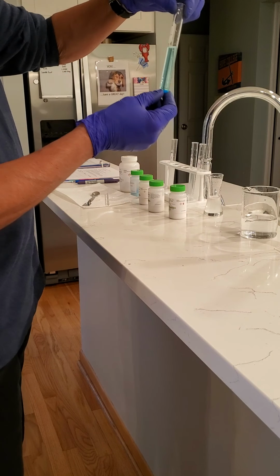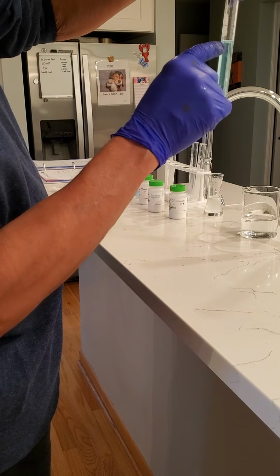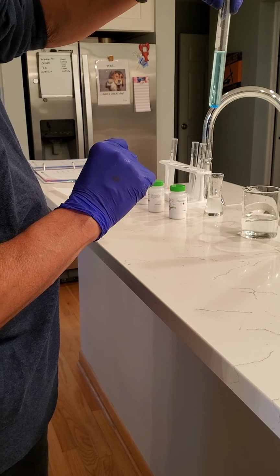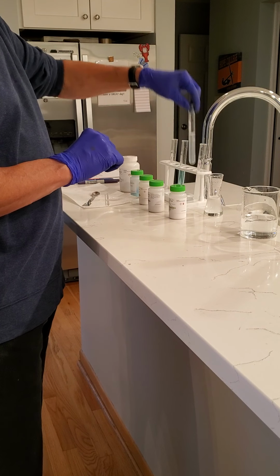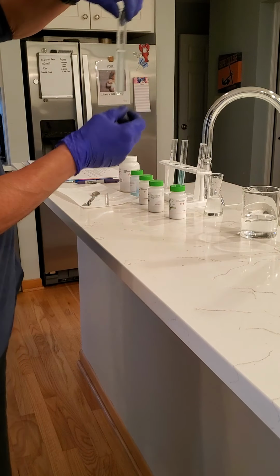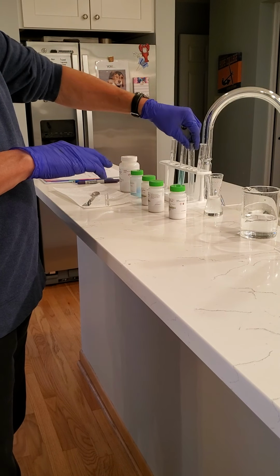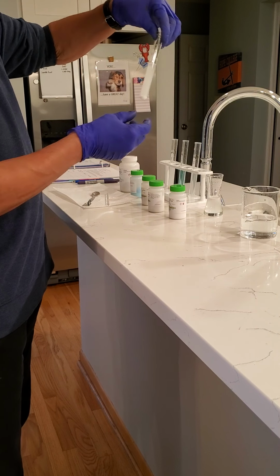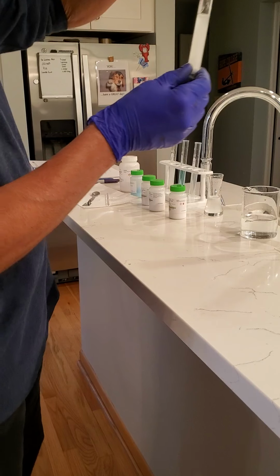Number 2 is our copper sulfate, and we remember this from other experiments. We still have solid on the bottom, but notice the blue color at the top. So that's probably slightly soluble, for example. And then number 3, where we have almost a totally clear liquid. And this was our sodium carbonate. So you rank that in terms of solubility. And then this is number 4. This is our potassium bitartrate.